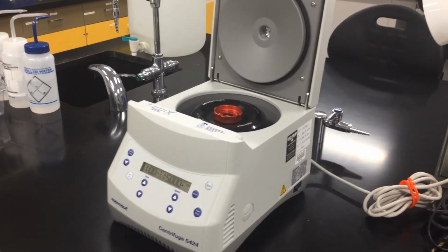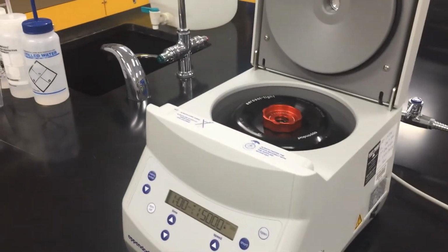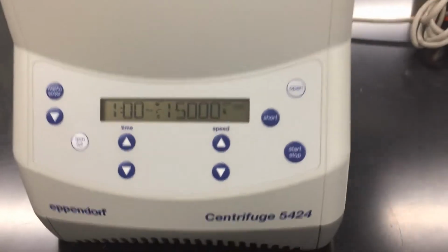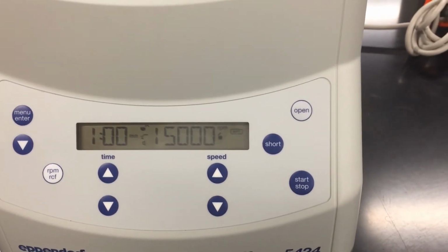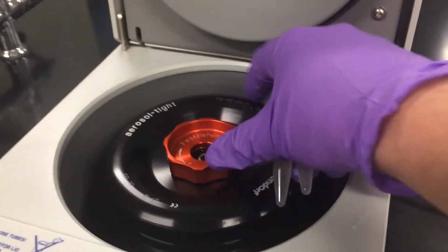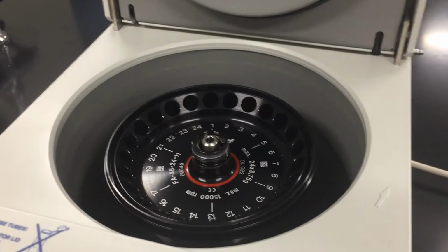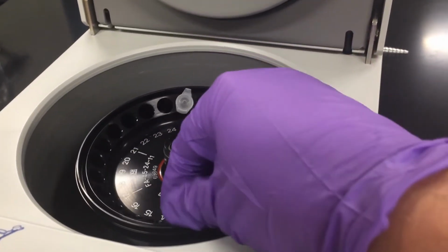Here's the microfuge. Basically it is a small centrifuge that is custom designed for these microfuge tubes. If you take a look, I can program the settings. Right now it is set for 1 minute and 15,000 revolutions per minute, 15,000 RPM. Basically what you need to do is take off the lid. I'm going to put in 2 tubes, and they're going to go in opposite one another.